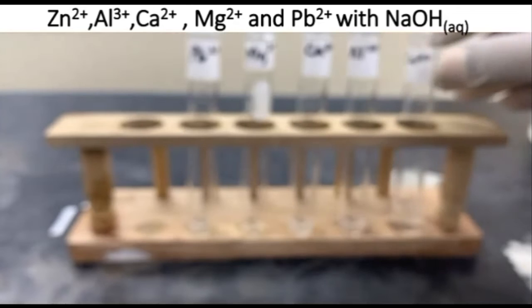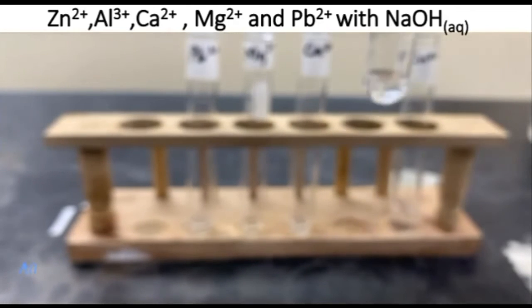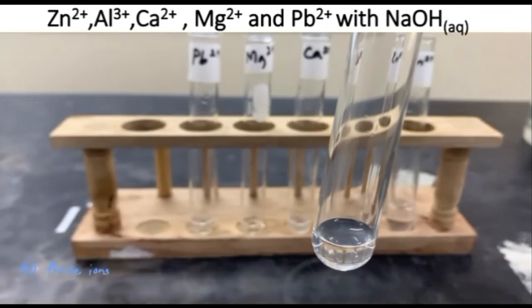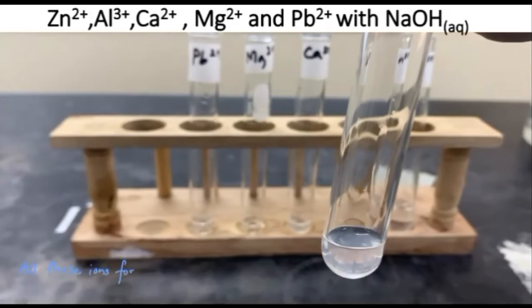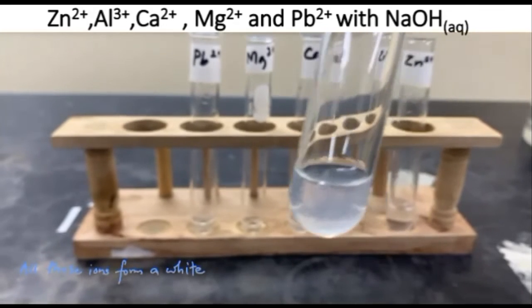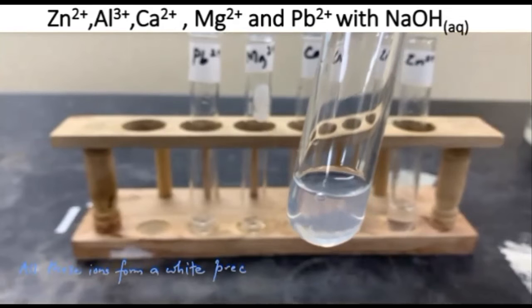So we go with the next one, aluminum. We're going to treat it similarly. We're going to add a few drops of aqueous sodium hydroxide, and we're seeing our precipitate emerging. Of course, it's not intense, but we're seeing a white precipitate.